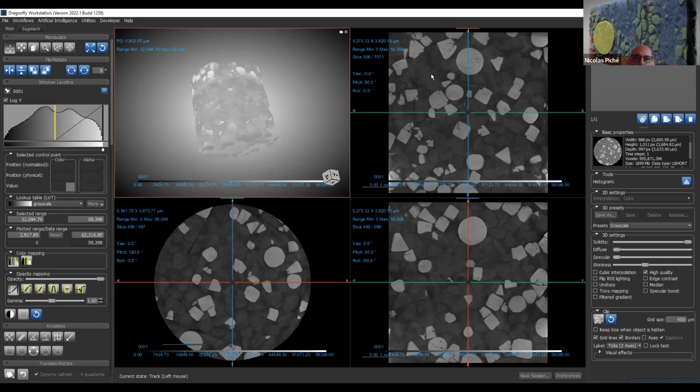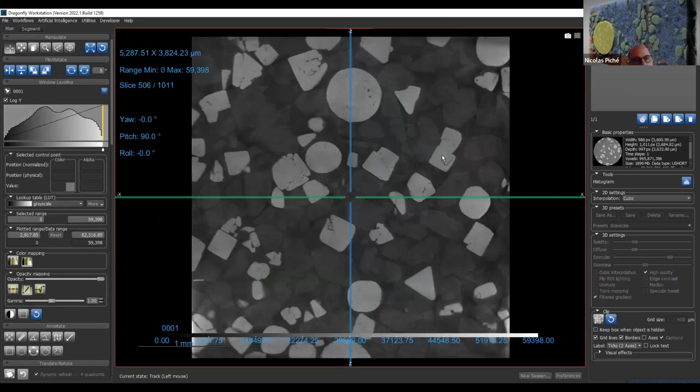When I'm doing 2D here, the data is cut in the data matrix, and we interpolate in nearest, cubic or linear, and we present exactly what we show, and we apply the transfer function. There are no integration rays and all that. You deal very differently with showing or highlighting part of the image.